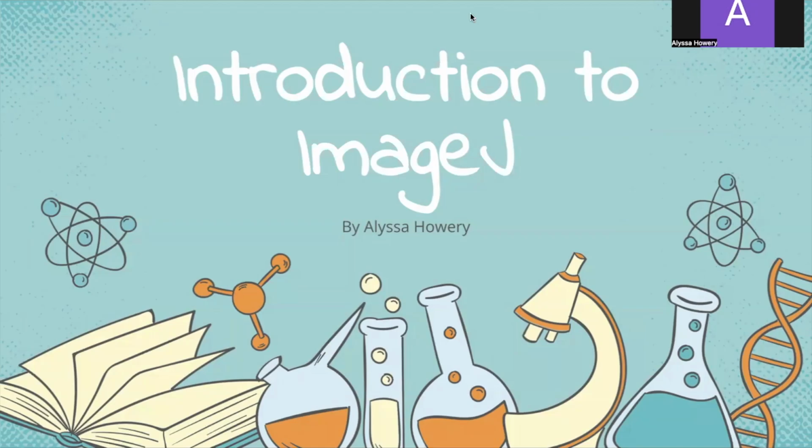A little bit about myself. I'm a sophomore at UNC and I'm majoring in biology. But today I don't want to talk to you about myself. I actually want to introduce you guys to a research tool that I find really interesting. The tool in question is called ImageJ, and it's something that I've used myself in courses in college.